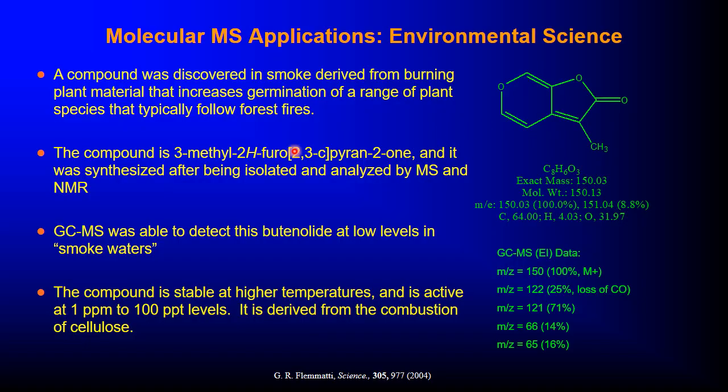You can see it here, the 3-methyl-2H-furo[2,3-c]pyran-2-one.